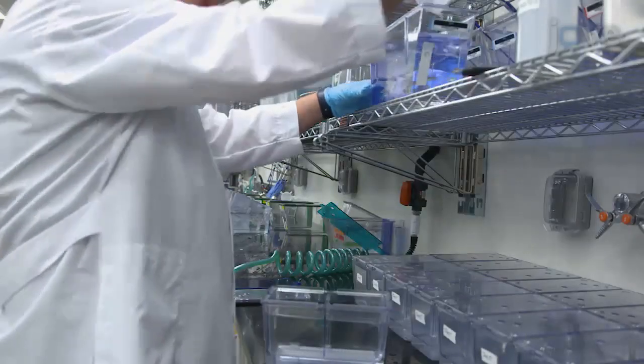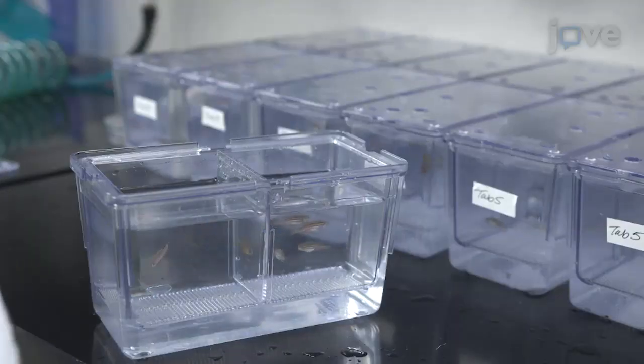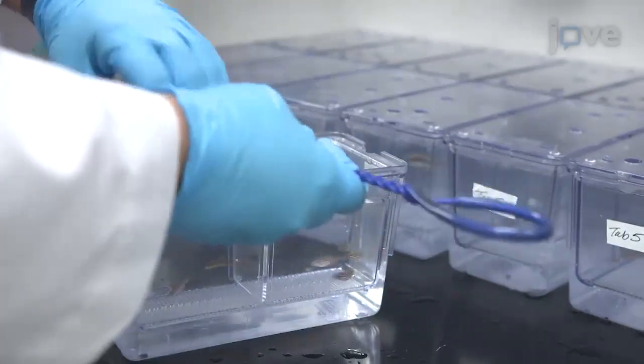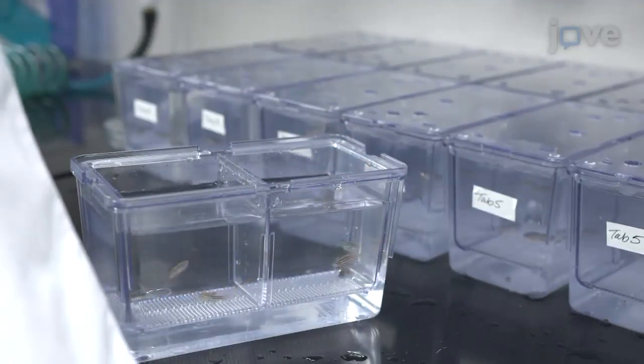The night before embryos will be collected, place dozens of breeding adults into breeding tanks using approximately equal numbers of males and females. Depending on the experiment, use one of the following breeding strategies.